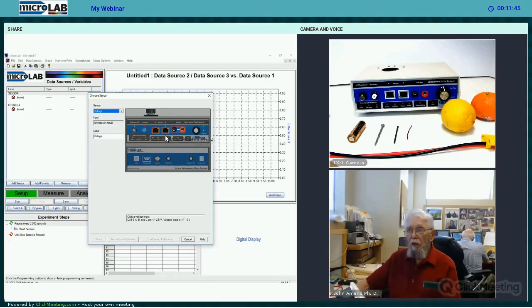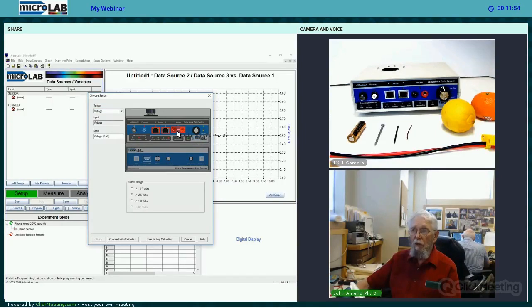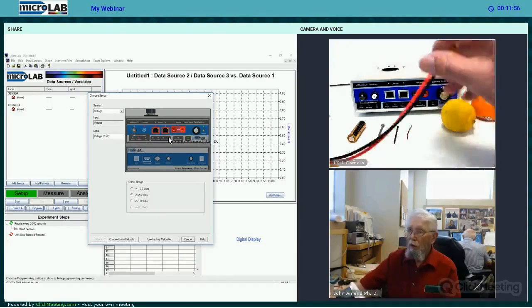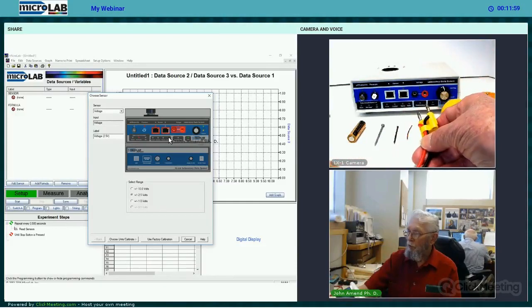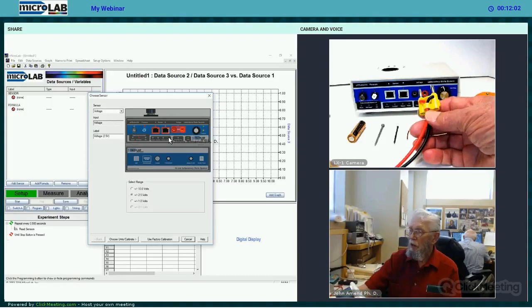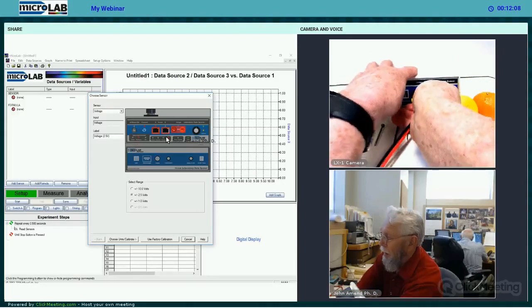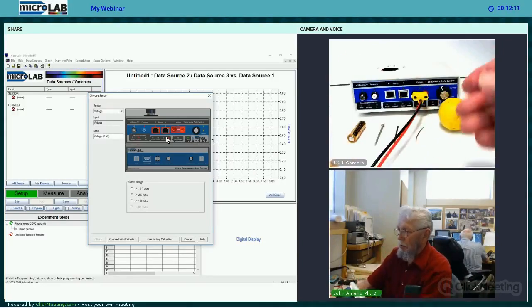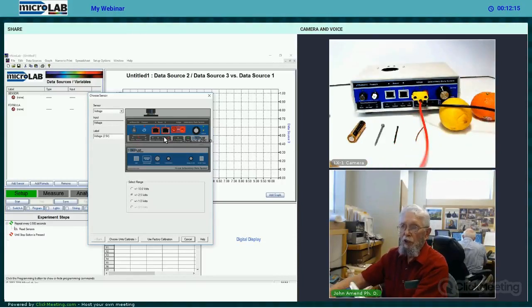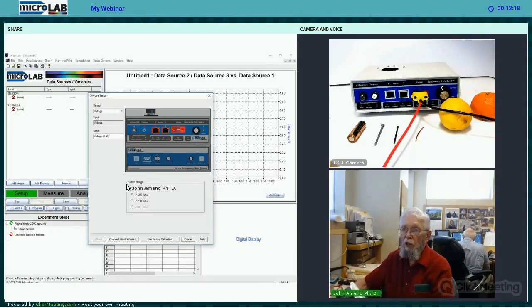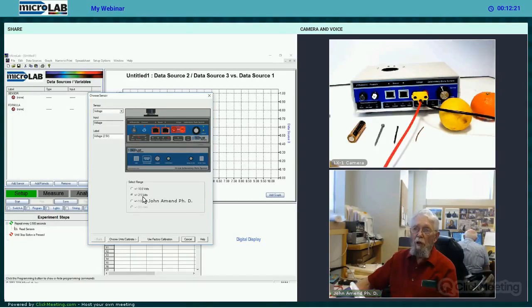And if we look down this lengthy series of sensors, we find one down there that says voltage. And let me see a screen that describes various positions in which voltage might be utilized. And we're going to use a simple one right over here that is just a little electrode pair. The red one is the positive, the black one is the negative. And we're going to put it in here at which point it should be in a position to measure voltage on this particular operation. And you'll notice that down here in the little thing, there's one that's labeled 2.5 volts.